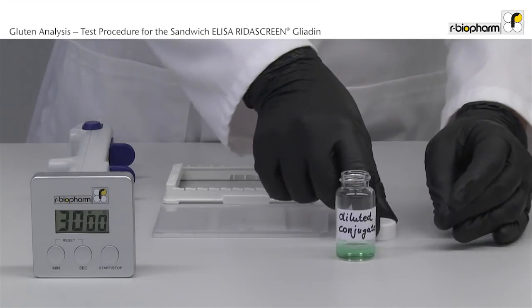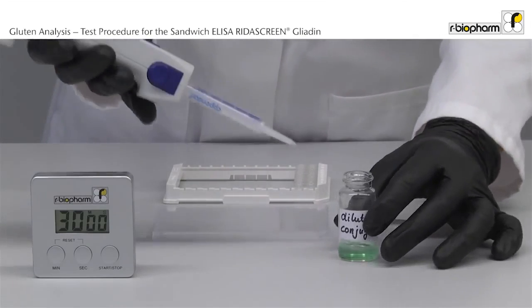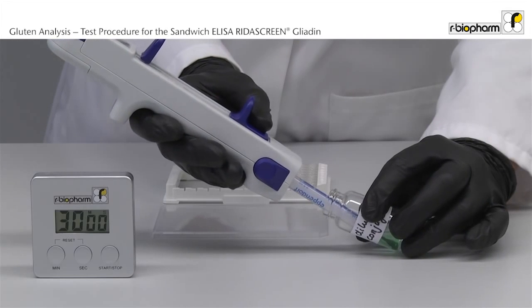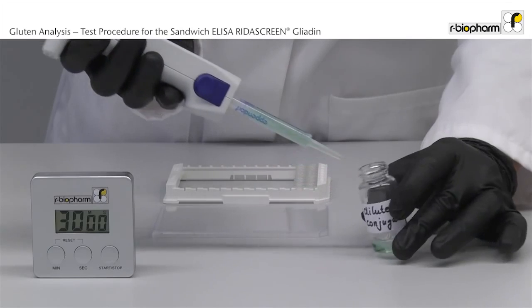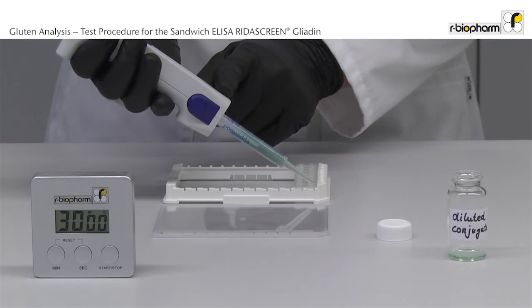Pipet 100 microliter diluted conjugate using a stepper. Flush the pipet tip several times and avoid bubbles. Discard the first aliquot before pipetting into the ELISA. Avoid splashing.